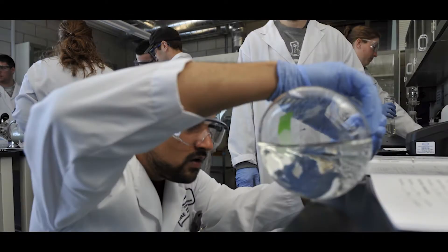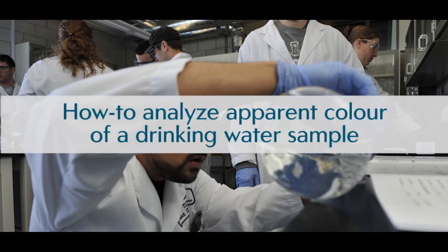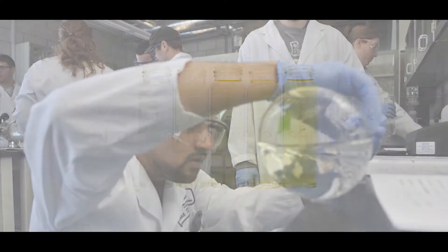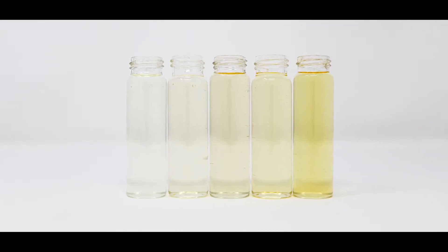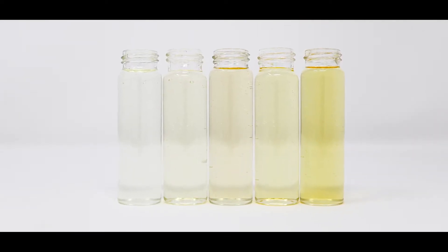The decay of vegetation creates organic materials that can give a yellow or brown color to water. Color can also result from the presence of iron and manganese. Color may be expressed as either apparent or true.